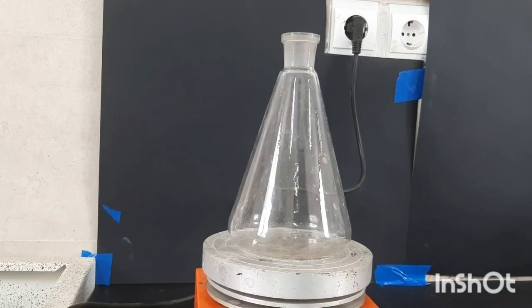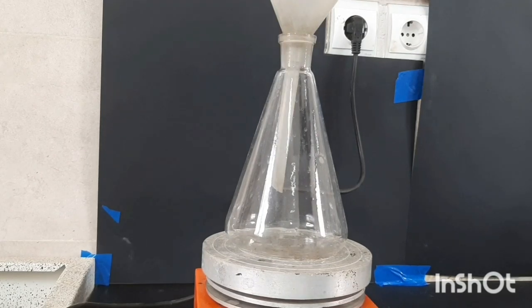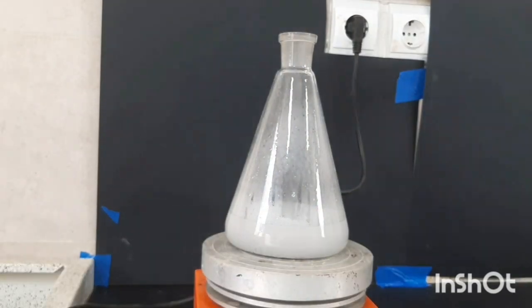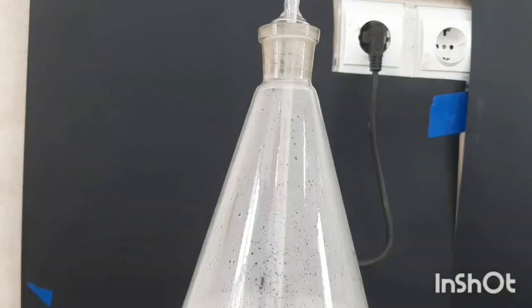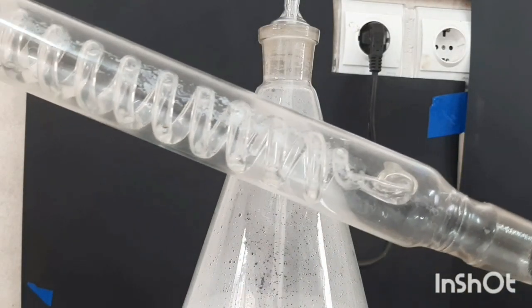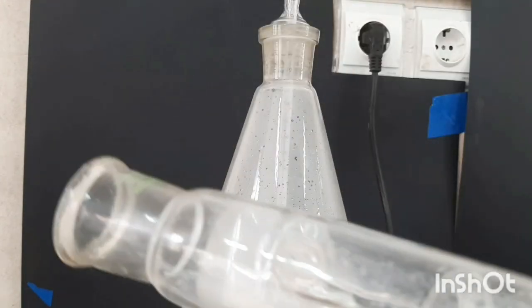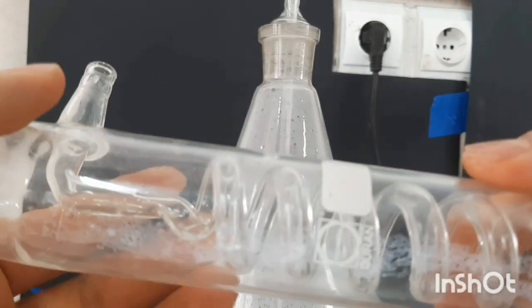So I'm going to add everything to a bigger flask to start heating. I'm gonna add a thermometer for now while I set up a reflux condenser. You want to use a condenser with water running through the tube, not the shell, because vapors and liquid in a small tube might clog and splash.